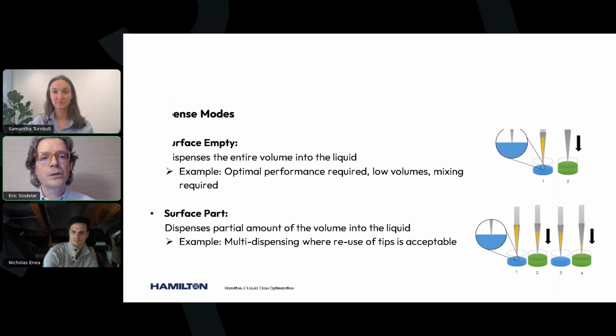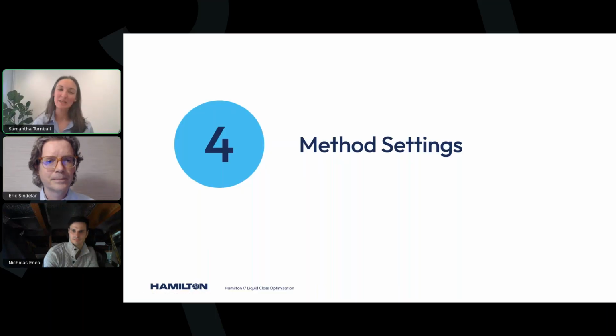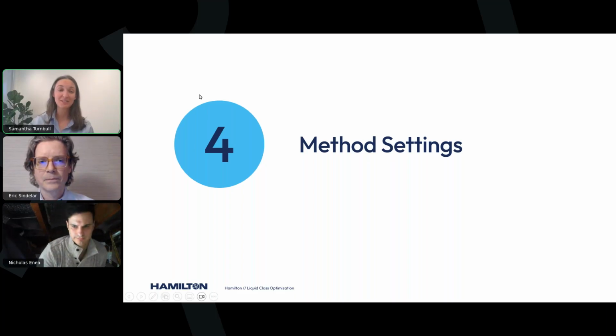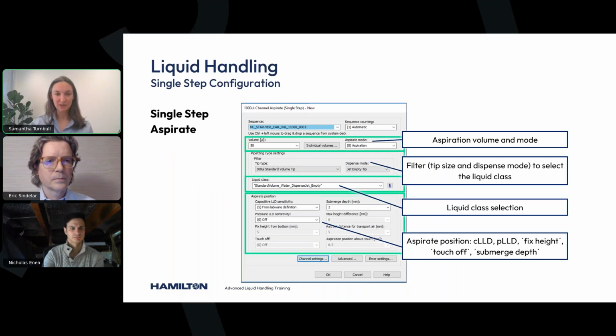Now I'll hand it over to my colleague, Samantha Turnbull, to give more insight on method settings and Labware settings. Thank you, Eric. In addition to all of the properties and parameters that Eric just mentioned, there are a number of settings within the aspirate and dispense commands themselves that will influence your pipetting behaviors. So let's start with the aspirate step.